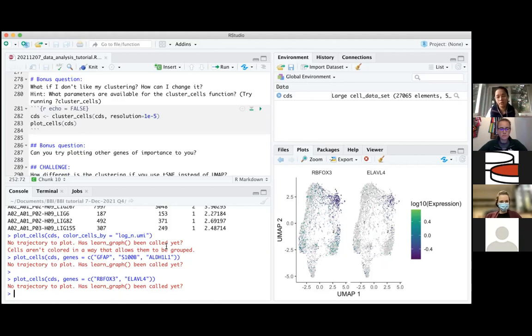That's when the resolution parameter comes into the picture. And you can try to run this with different resolution values to see if the clustering changes a bit. It doesn't completely change the underlying algorithm of how it clusters. It will just make better sense when it comes to cell type identification, when they need to cluster together as a group, even if there are several different subtypes within a cell type.